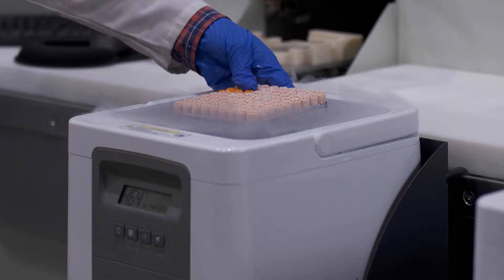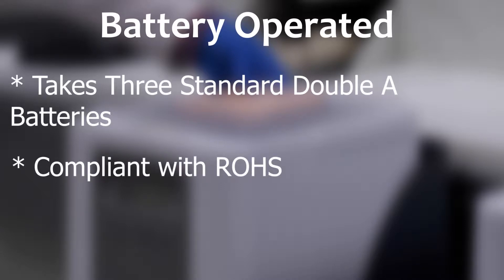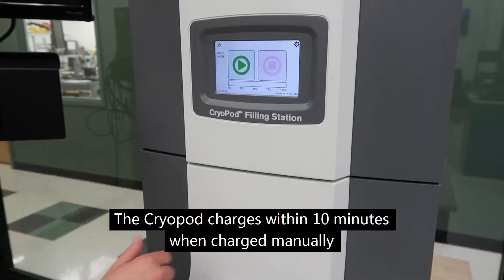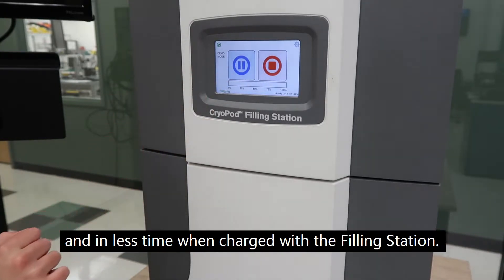station. The cryopod is battery operated, taking three standard AA batteries, and is compliant with ROHS and follows EN 61326 and EN 61010. The cryopod charges within 10 minutes when charged manually and in less time when charged with the filling station.